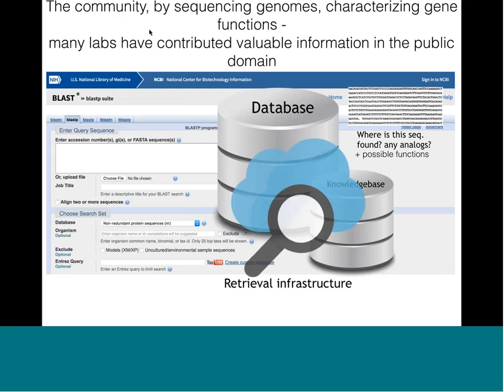And the reason why we're able to answer these questions in sequencing is because the community has basically created a database with genomes, metagenomes, and genes, and when they characterize individual gene functions, those annotations are retained as the knowledge base.